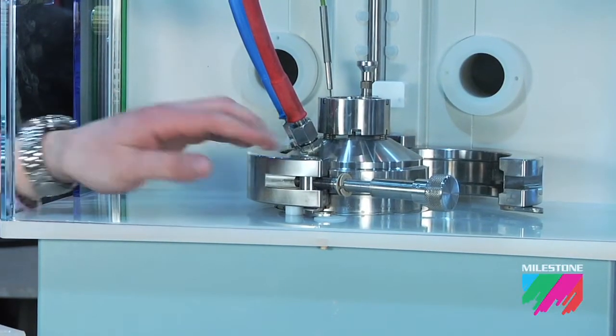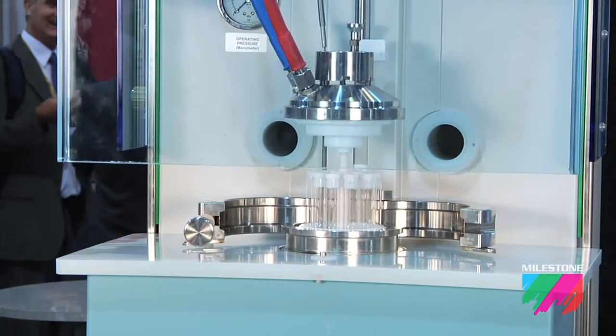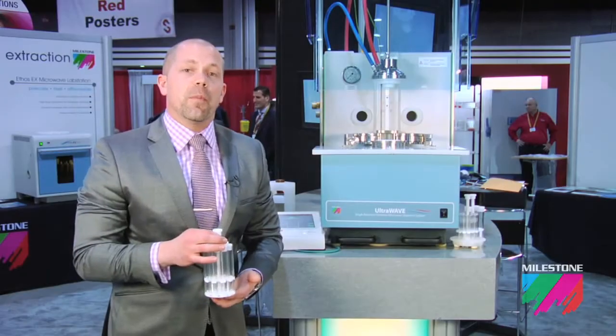The chamber clamps are then opened, the rack is raised from the chamber, and the rack is removed, ready for simple dilution and transfer to the ICP or ICP-MS.